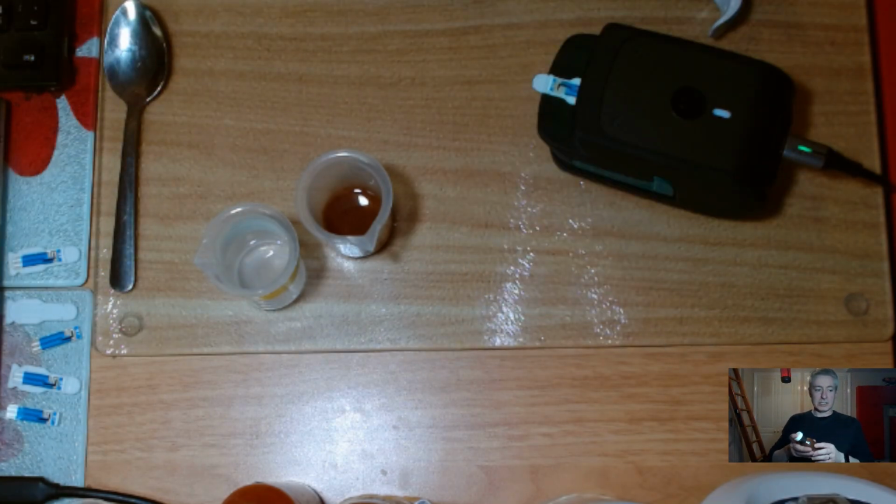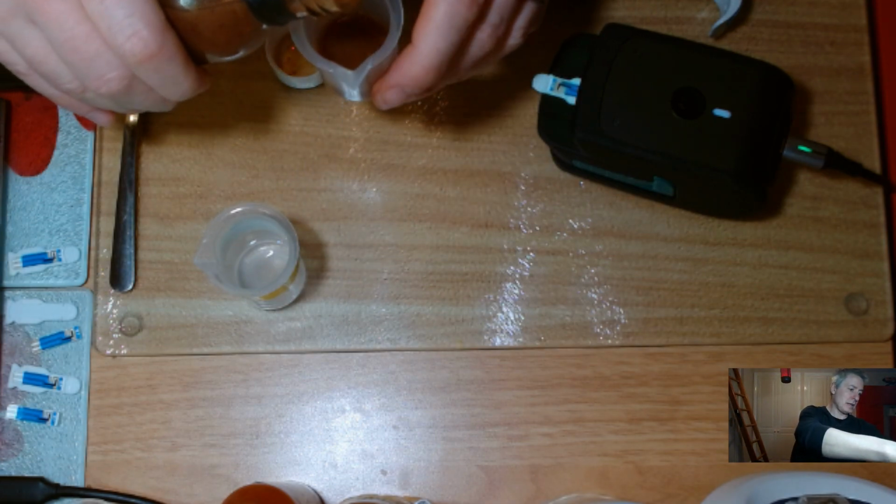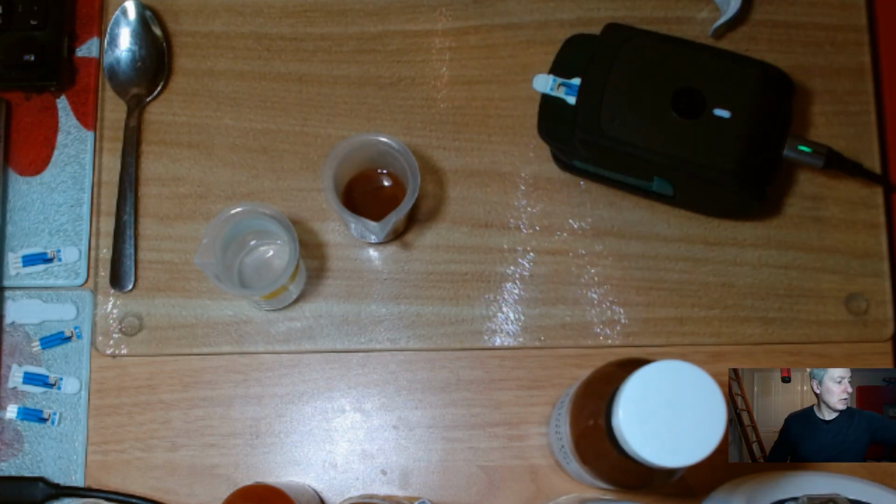I'm just going to shake this up quickly. So this is a kind of, I don't know if I want to say a vinaigrette, but it's a balsamic vinegar anyway, with this Chipotle Habanero in there. What I will do is pour out a bit into a beaker so you can see that it's thin enough that I can actually use the pipette to measure it out.